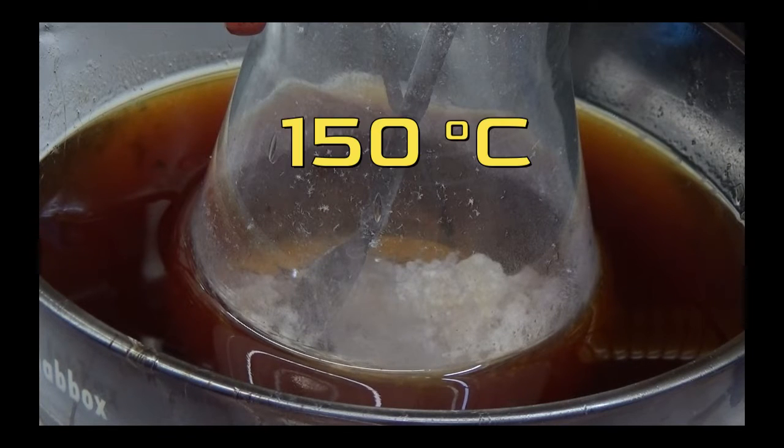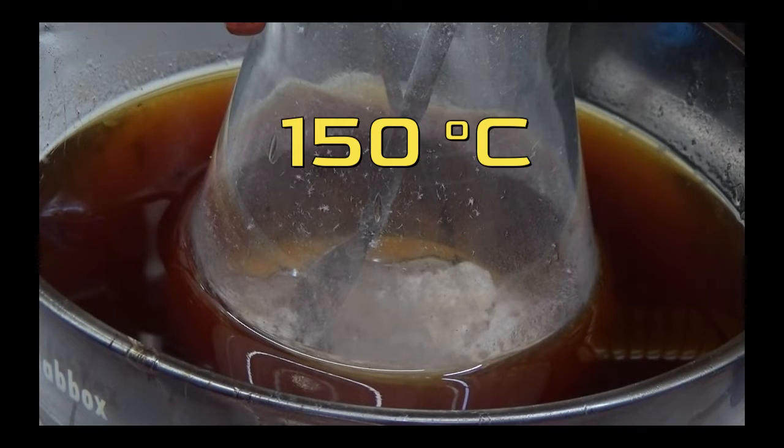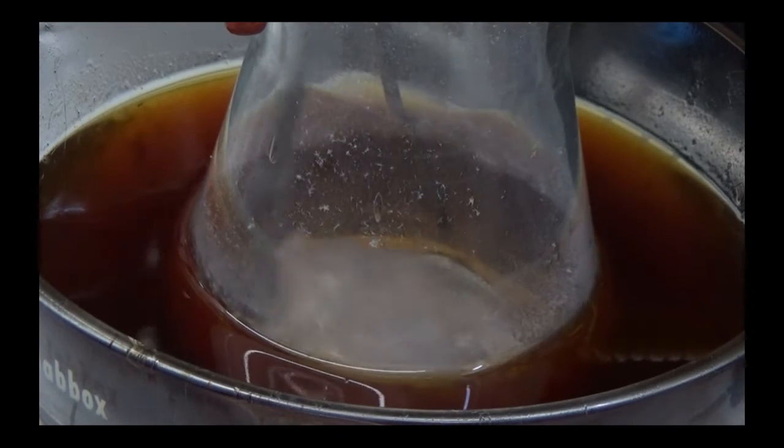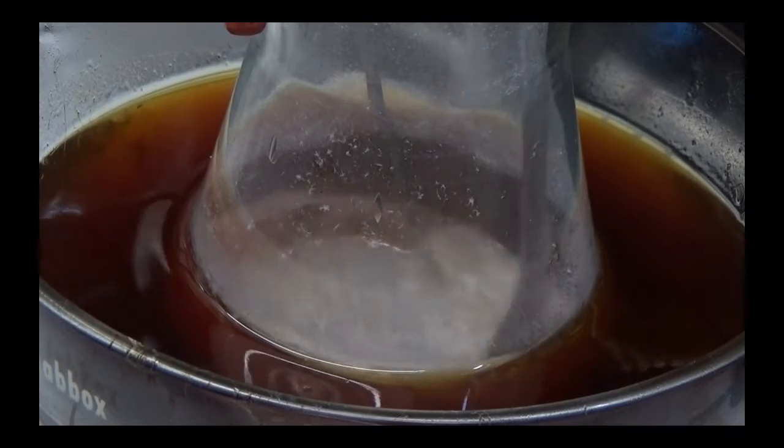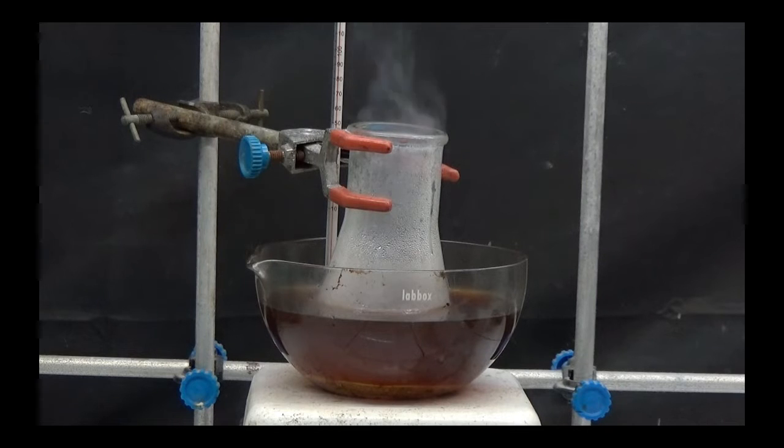Heat the flask in an oil bath until it reaches 150 degrees. Once the mixture melts, homogenize it with a spatula and continue heating for 2 hours while stirring. Toxic fumes are produced by this operation. Working outdoors or in a fume hood is recommended.